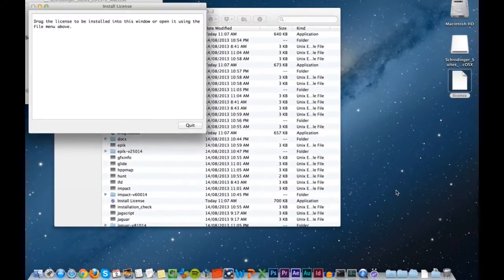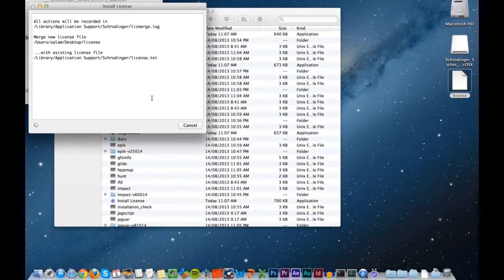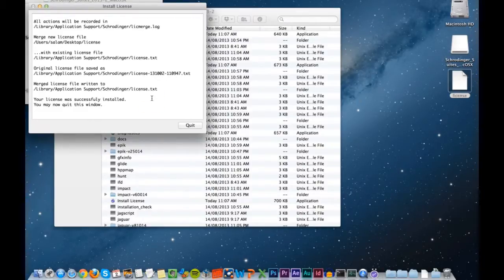Now drag the license file from the desktop into the install license window. This will install the license file into library application support Schrodinger.